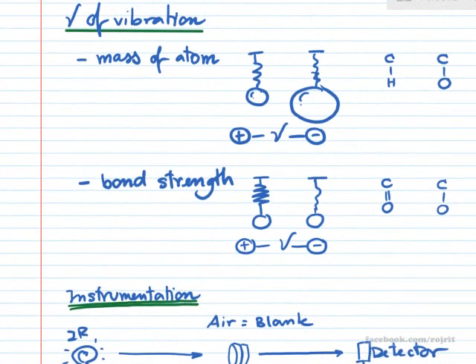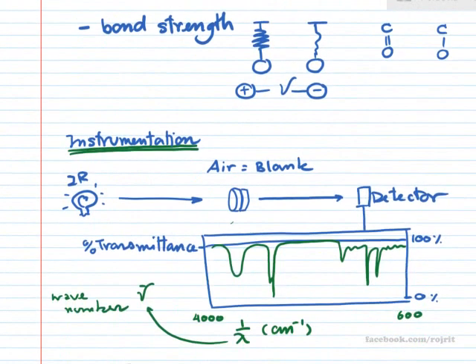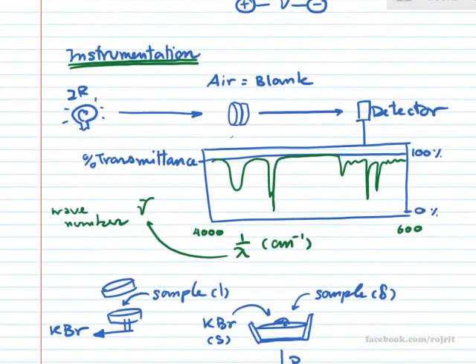So it tends to have lower mass on the left-hand side, and also double and triple bonds on the left, single bonds on the right, and higher mass on the right, things like that. You will see the relationship in the IR spectra afterwards.